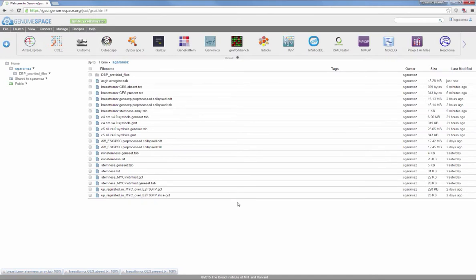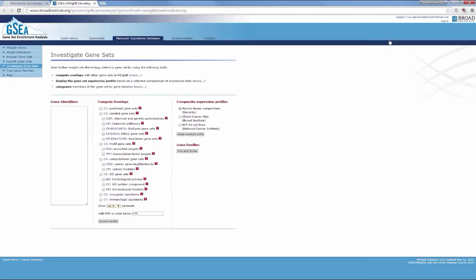Click the MSigDB icon in the GenomeSpace toolbar to open the tool. Click the Downloads tab.